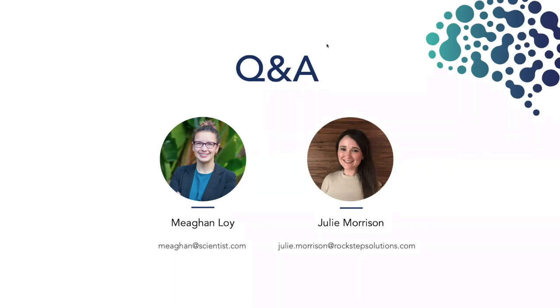Cool. All right, we have another question that's come in. Does the system accept external reference lab data or export collection data to an electronic data capture system? So it looks like basically, can you import data and then export? So the answer to that is yes. There's a couple of different options there.